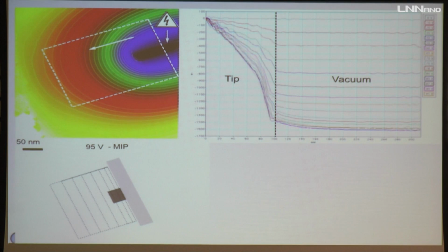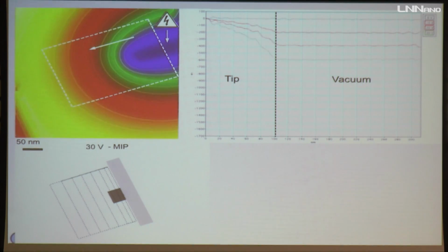And then in parallel to that, you have an increase, I will show it again, of the number of electrons that you are putting in your nanocone until the time you reach the value for which electrons are emitted. Okay, so you have no additional electrons there, because the electrons are emitted and going to the anode.